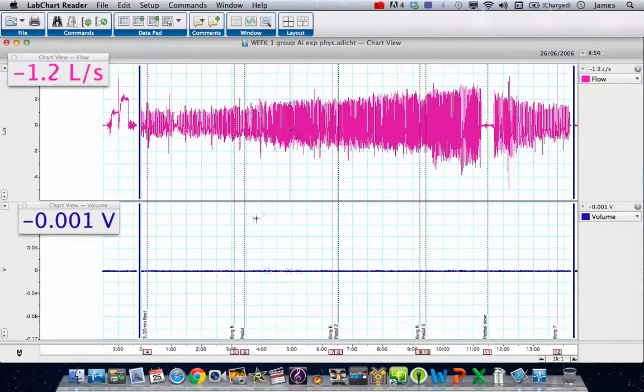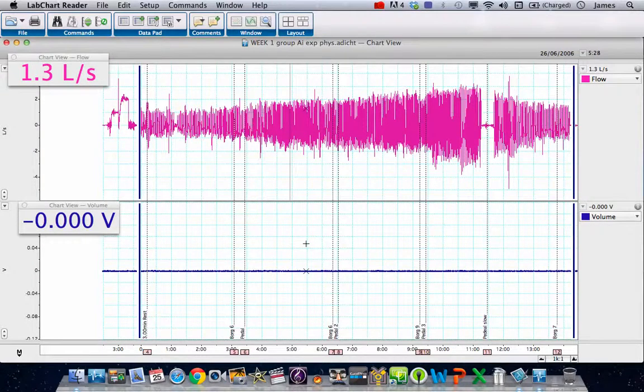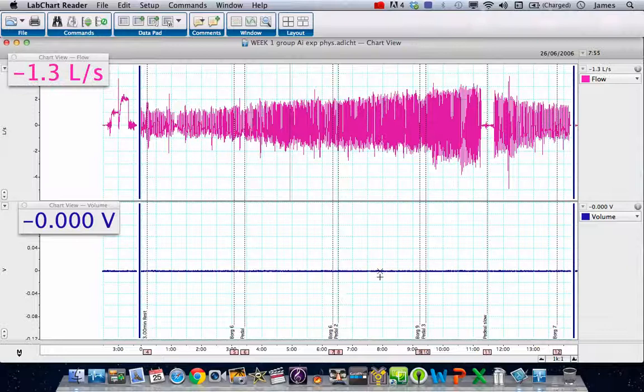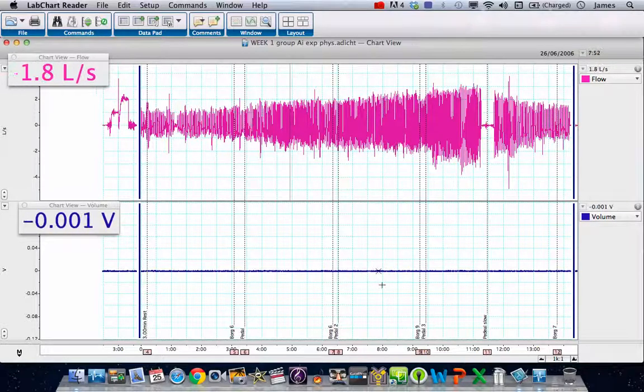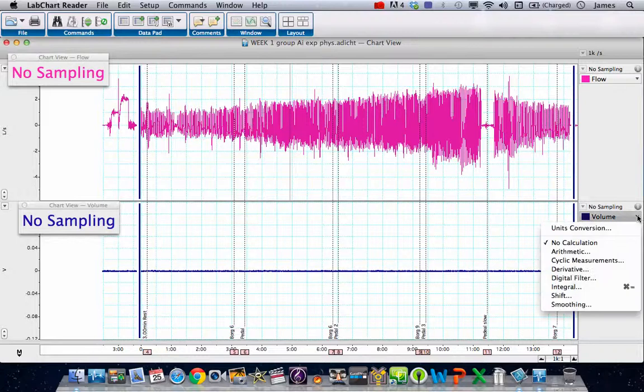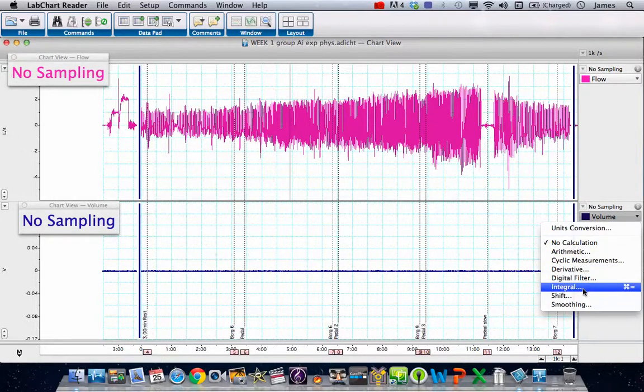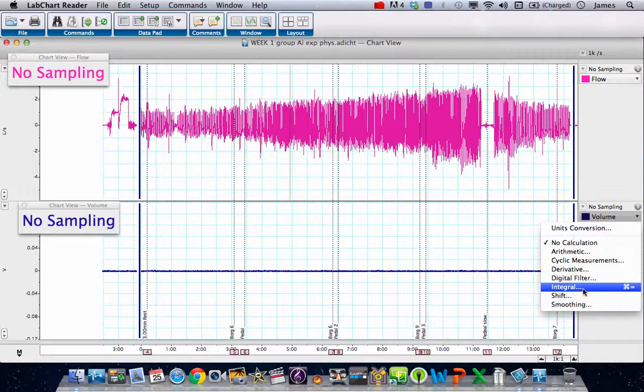This doesn't help us with our volume, because our volume is still showing zero volts. The reason is the volume is still trying to read off a non-existent pod and module. We can click on the volume drop box and choose integral, because to work out the volume of gas that shifted with a given flow, when we've got the data for the flow, we can integrate it to give us the volume.